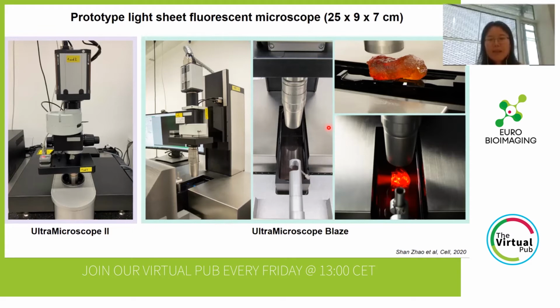And here we can clearly see that an intact human kidney can be mounted on the sample holder. And when we put the sample inside of the chamber, full of the imaging solution, and switch on the light, we can see that the light can pass through the very transparent sample to show the transparency. And with this powerful light sheet fluorescence microscope, we can image very large human organs.